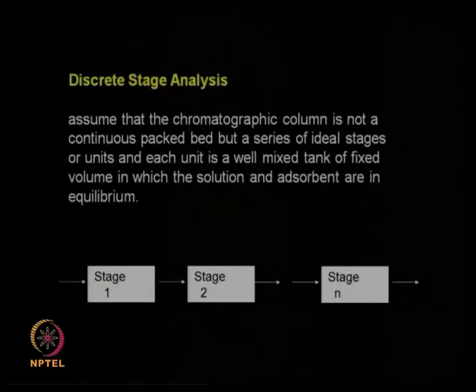Okay, now we talked quite a lot about different types of chromatography. We talked about hydrophobic or reverse phase chromatography, we talked about ion exchange chromatography, we talked about gel permeation or gel filtration chromatography, then we talked about these ligand based affinity chromatography. All these are the basic chromatographies, and there are many modifications to this where we are talking about ion suppression chromatography and so on.